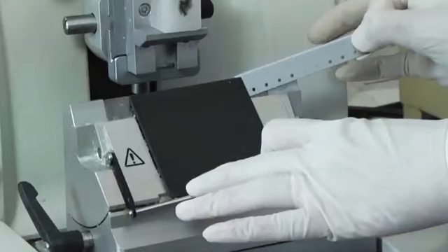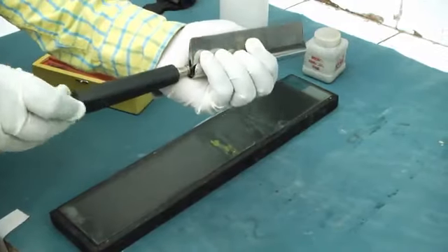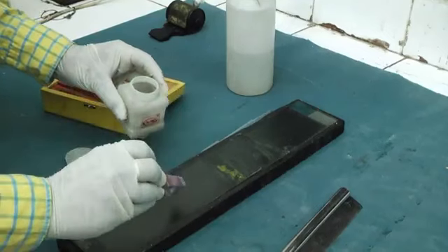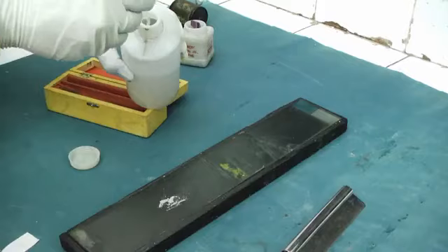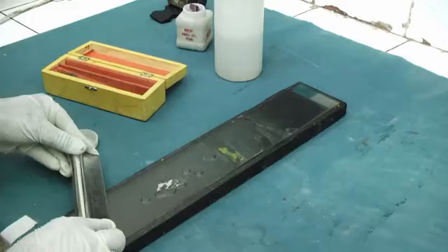If you are using non-disposable knives, sharpen the knife by the following techniques. Honing. Microtome knives are sharpened against a special stone called a hone. Honing refers to grinding the cutting edge of the knife on a hard abrasive surface to sharpen the knife.